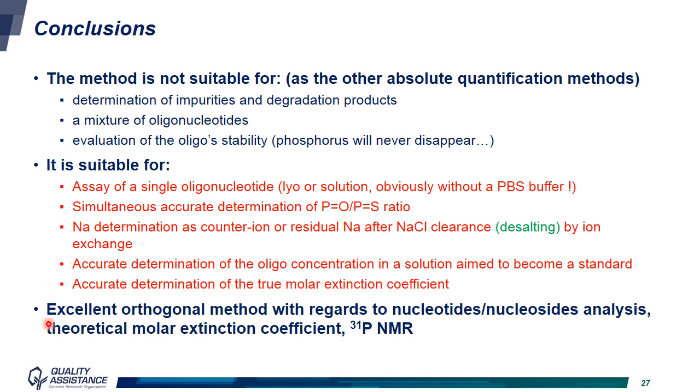So, it is an excellent orthogonal method with regards to the nucleotides or nucleosides analysis versus the theoretical molar extinction coefficient calculation, or versus the phosphorus NMR.